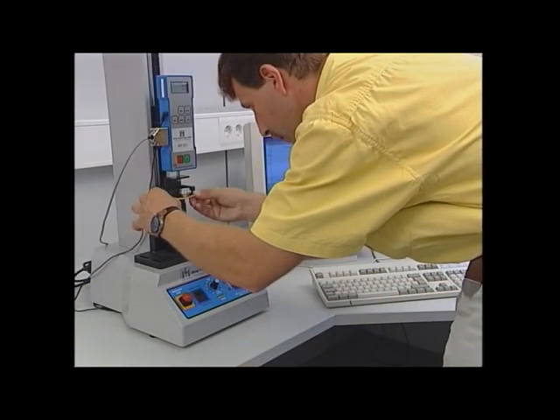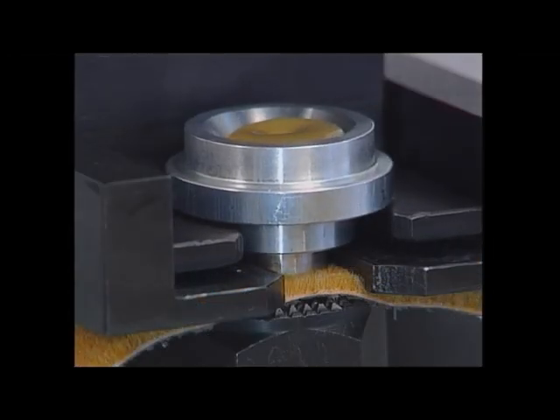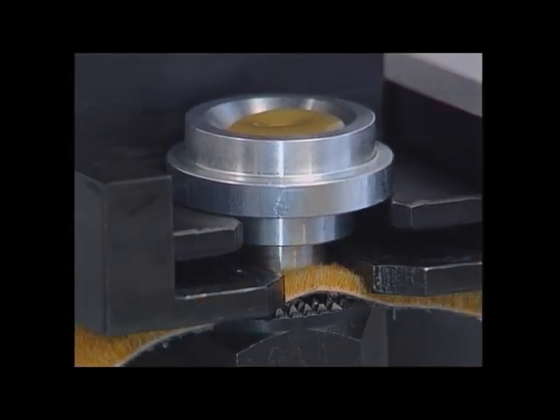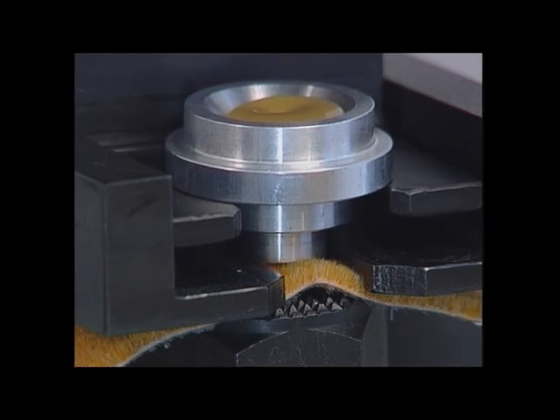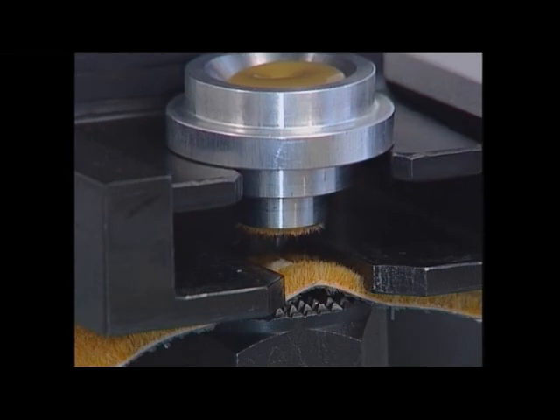The tear-out test directly measures the quality of the Flock anchoring. With a small aluminium form specially adapted to a clamping system, an extremely powerful hot melt adhesive is poured onto the Flock surface, and the power required for tearing off is measured after the molten adhesive has cooled down and hardened.